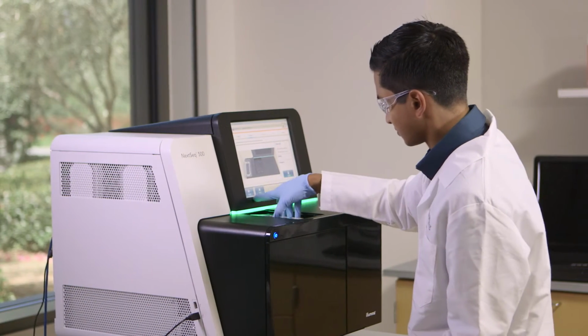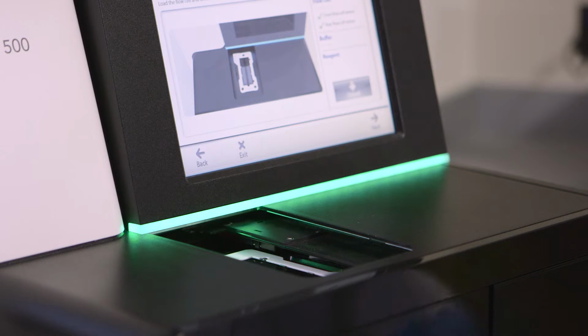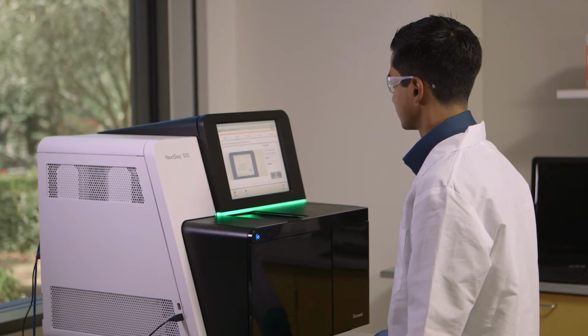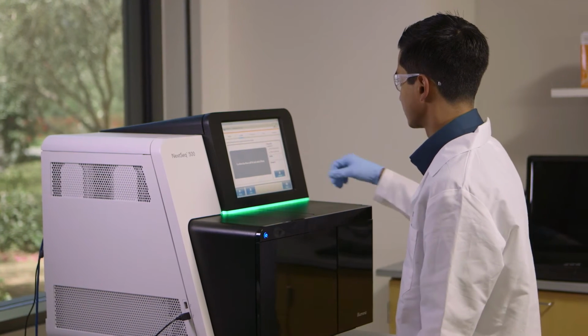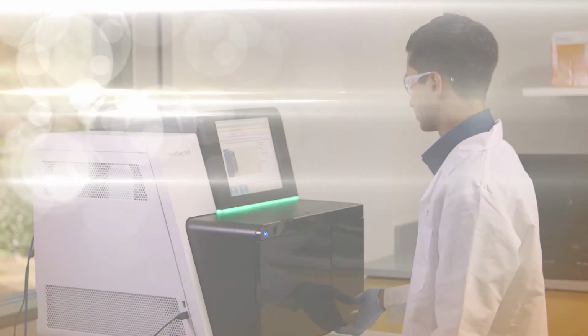Illumina has really thought about the user. They've thought about making the sequencing the easiest part. By making the sequencing much easier for the user, it allows a faster turnaround to deal with the harder parts of the experiment on both sides of the sequencing, the preparation and the analysis.